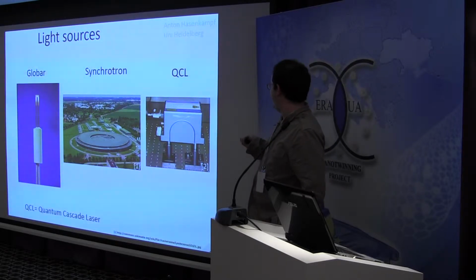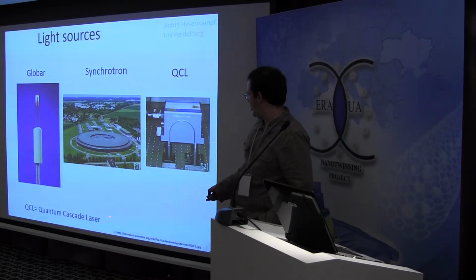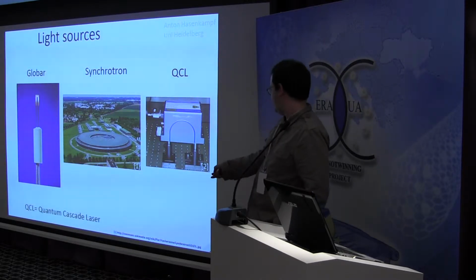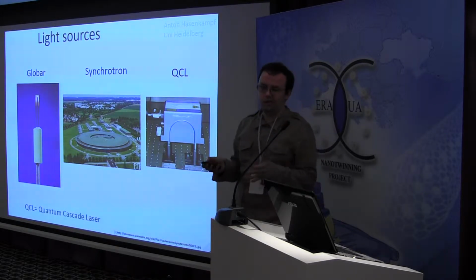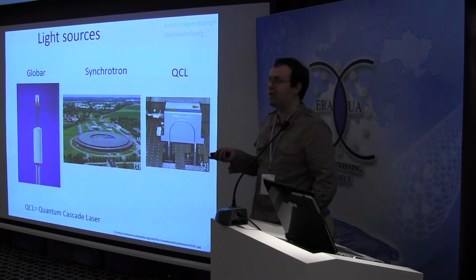And the third source, which has become common in the last 5 years, is the QCL, like quantum cascade laser. It has the size of a small shoebox. It's pretty small and fits on every optical table.